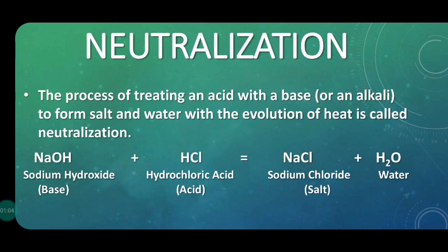Take a test tube, fill some vinegar, acetic acid, in it. To this solution, if you add soap, which contains a base. Vinegar contains an acid. Acid reacts with the base. The reaction continues. So we can define this reaction as the process of treating an acid with a base.